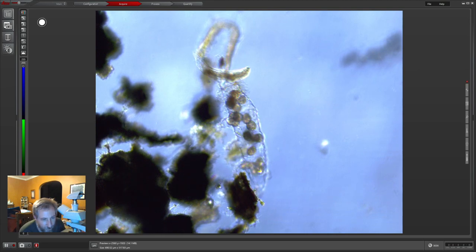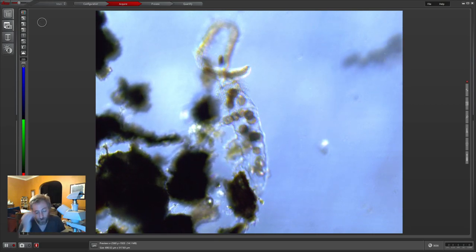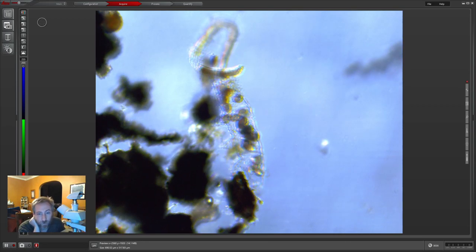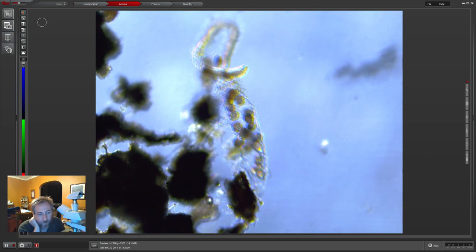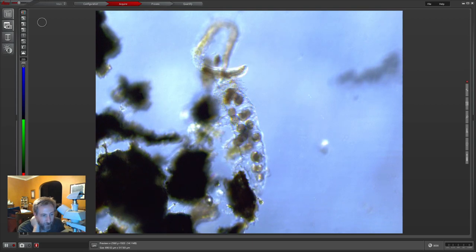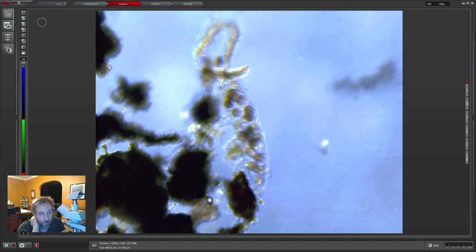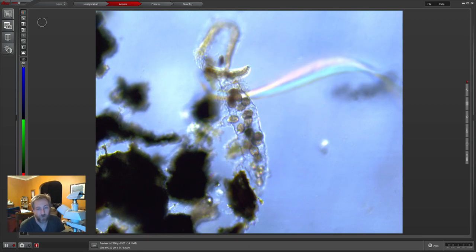Do they have abundant heat shock proteins? When they're in the tun state — their cryptobiosis state — water bears can handle extremely high temperatures. But when they're just hanging out in the water like this, they're pretty sensitive and wouldn't be able to handle temperature shocks, either cold or hot. They're not indestructible. The tun state is like a special setting where they become dehydrated and turn into little balls that are super well protected.